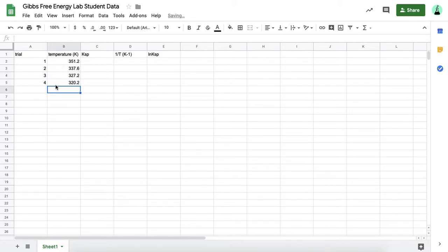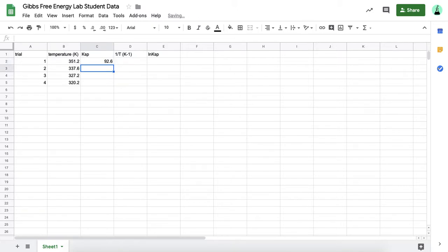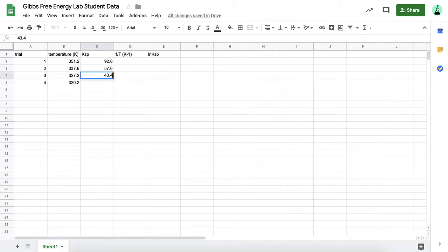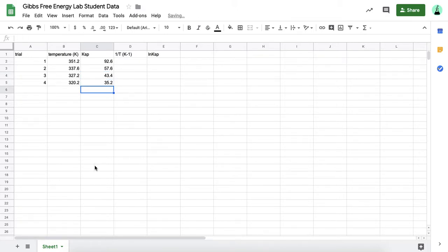And then I'll move over to the solubility product constant. I did have to do a little bit of calculations before I got to this point just to get this value, and that's going to be on your lab worksheet. So when you get to this step, this is after you've done the lab, and you're just processing your data.